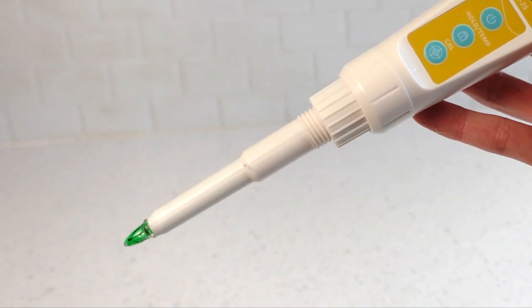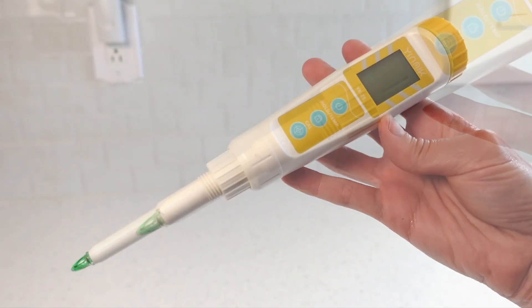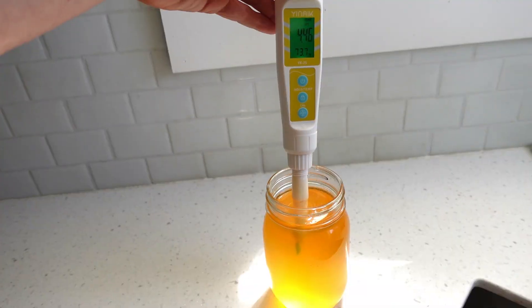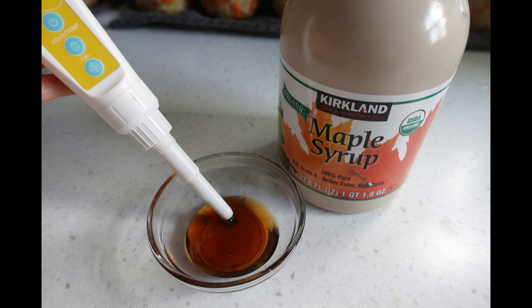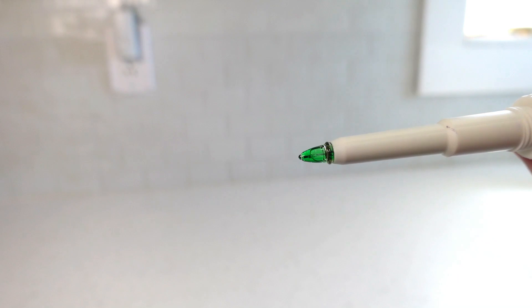The probe of the upgrade pH meter is exposed. It's designed to handle the same kinds of liquids as the basic meter, but additionally substances such as bread dough, jams and sauces, honey, syrups, yogurt, kefir, and even soft solid foods like cheese. The glass of the probe is much more durable and can handle contact with substances without breaking or going wonky.